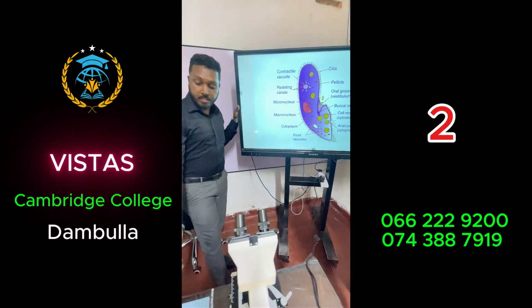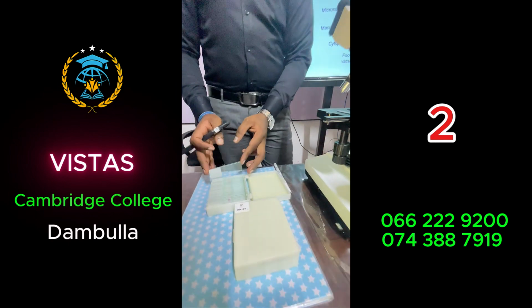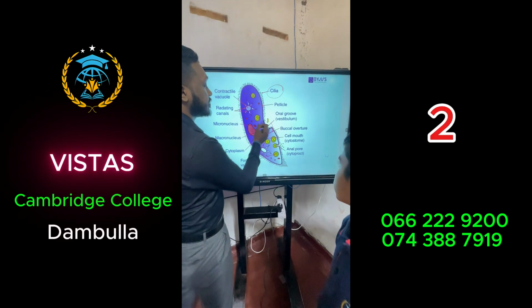You are given slides here. I'll give you these slides. Just try to identify this part, right? Cilia and the cell mouth.